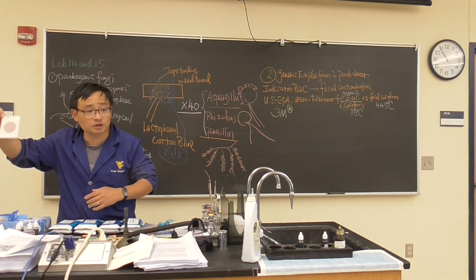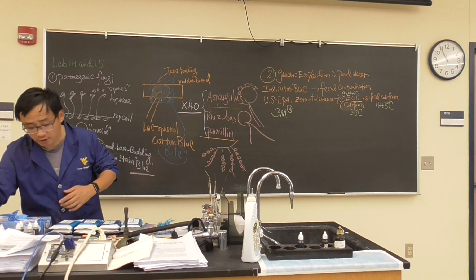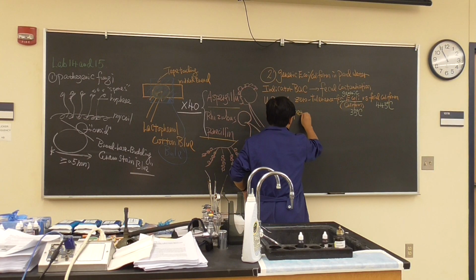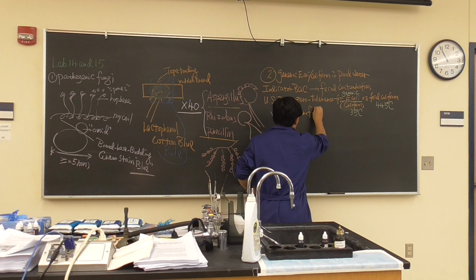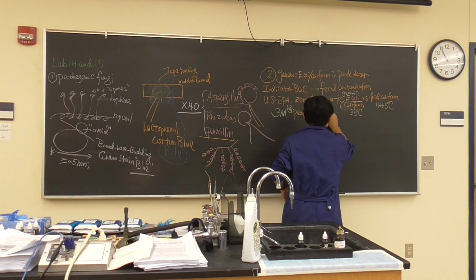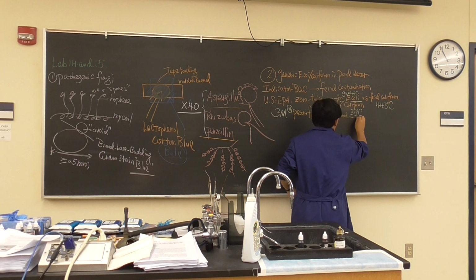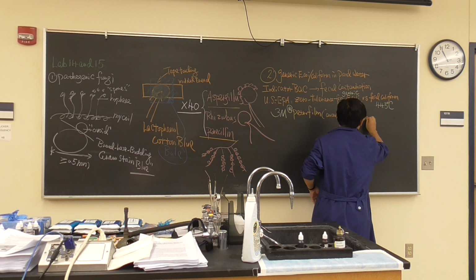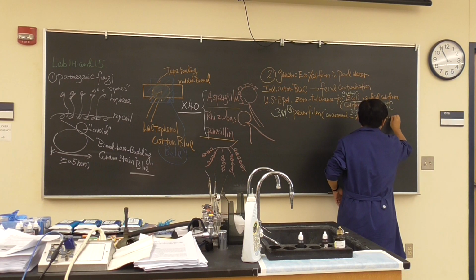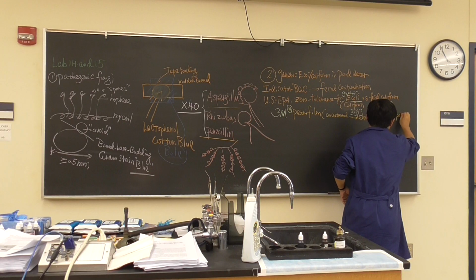It's dehydrated paper media called Petrifilm. That's why we call it 3M Petrifilm. It is a concentrated, dehydrated, solid paper media.